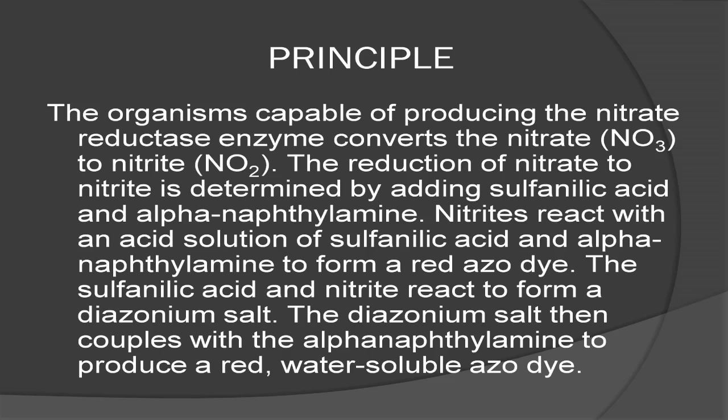The nitrate may not have been reduced, so the strain is nitrate negative, or the nitrate may have been reduced to nitrite, which has then been completely reduced to nitric oxide, nitrous oxide, or nitrogen, which will not react with the reagent that reacts with nitrite. The strain is nitrate positive.